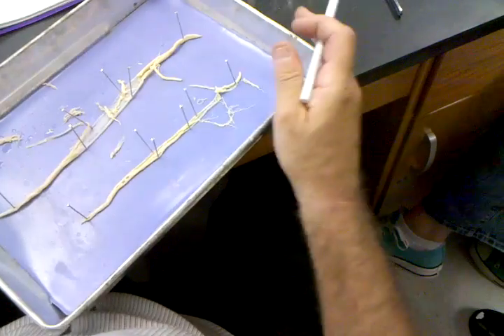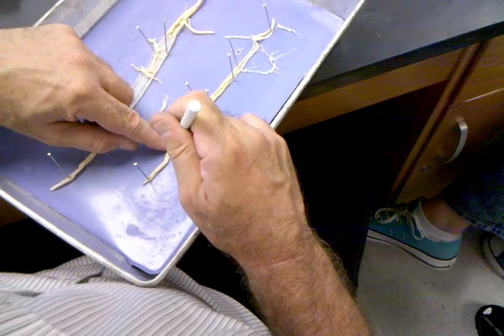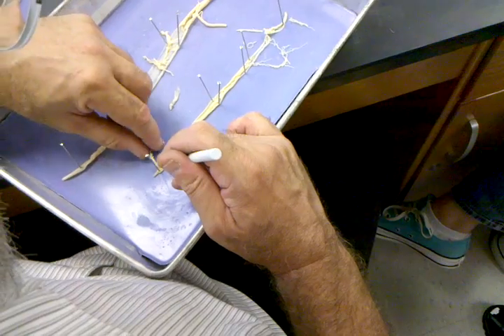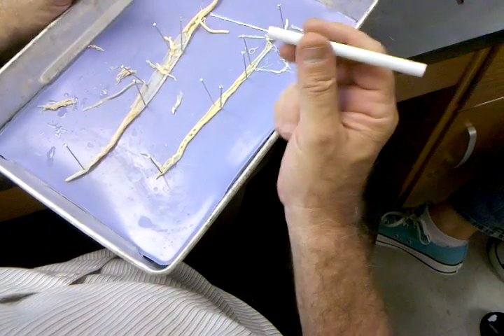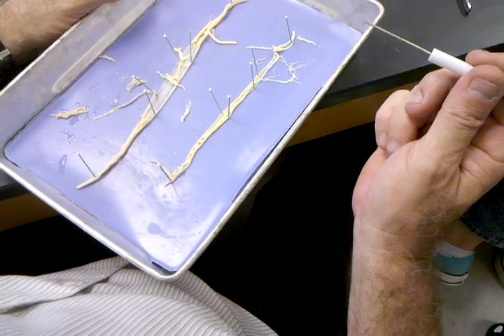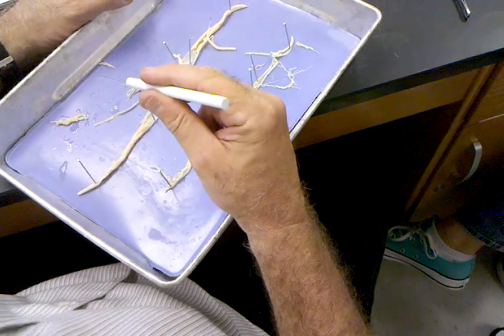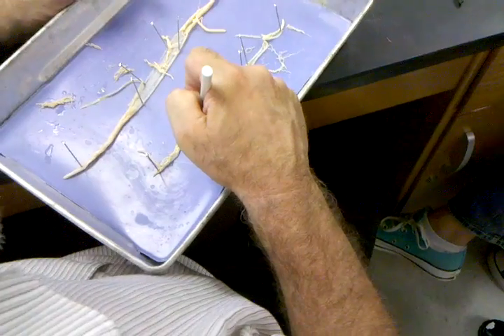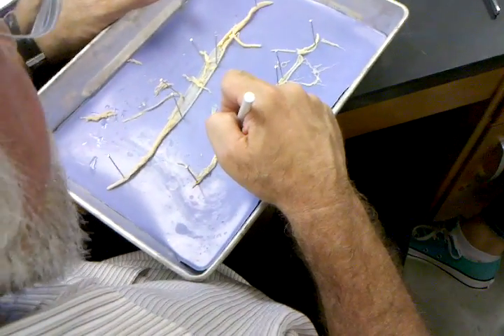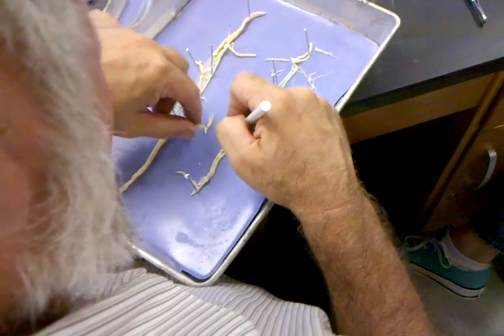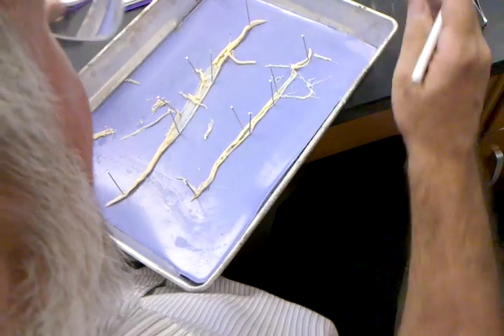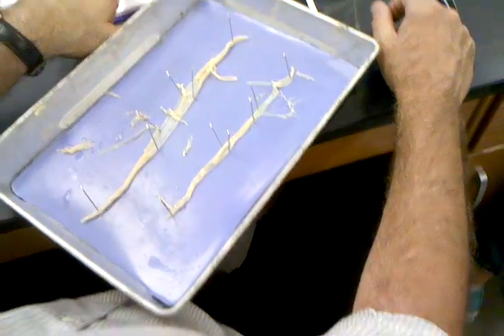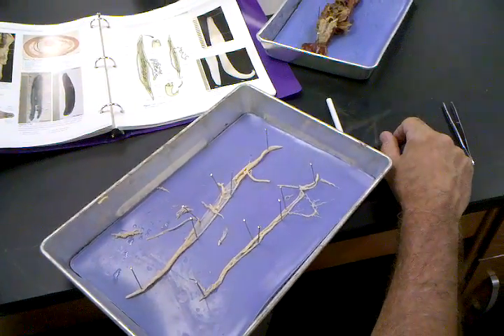Let me make sure you've got anterior and posterior. If you're saying both ends are tapered, how do you know? So, how do they reproduce? Sexually? The male has a copulatory organ that is literally like a hypodermic injection into the female. It is really quite a wild thing in roundworms. That's copulatory spicules. Did we do all the critters? Are we all right with that? This is not too hard.